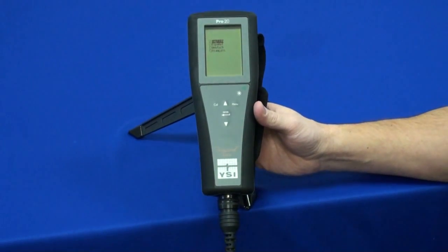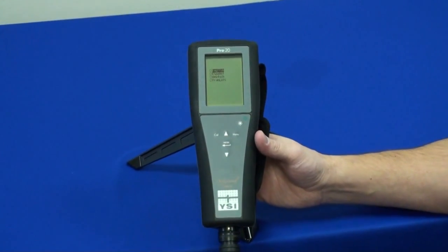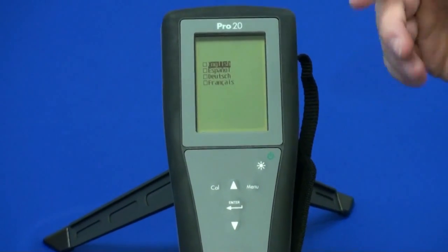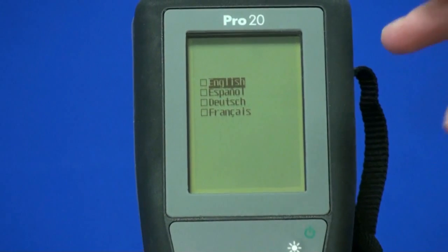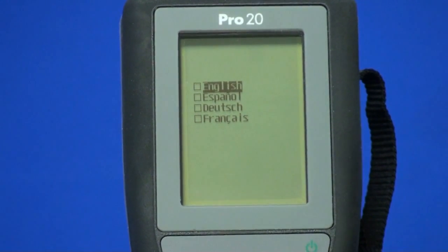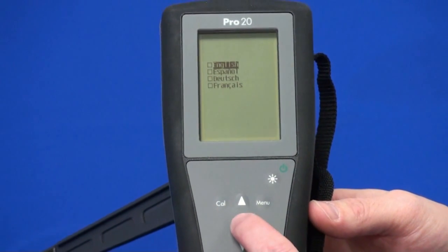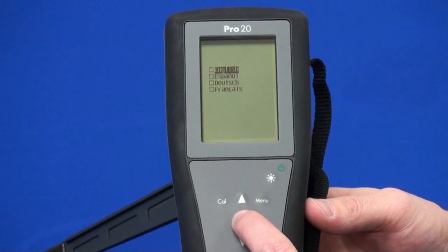Now we're going to run through the initial setup of the Pro 20 instrument. I've got the batteries installed and the power turned on. The first screen that comes up is to select the language. I'm going to go ahead and select English by pressing enter.